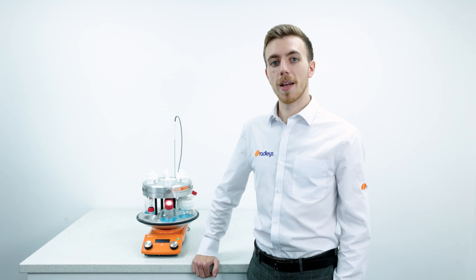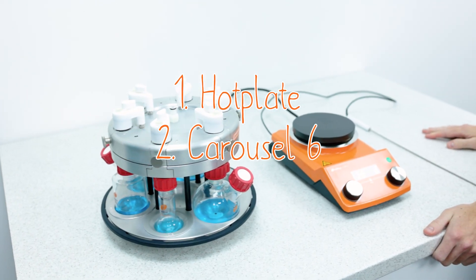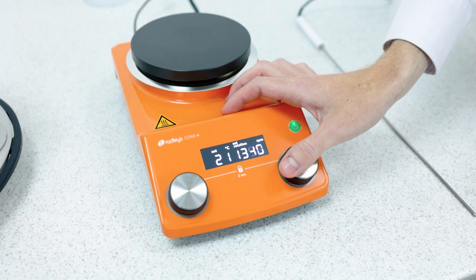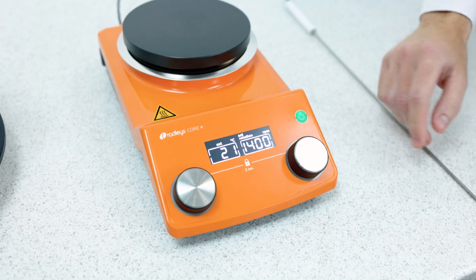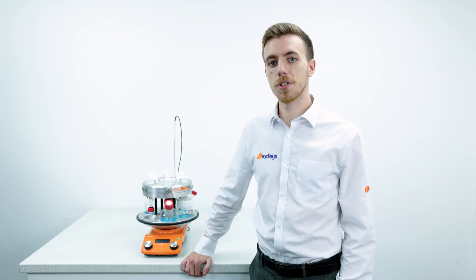The Carousel 6 Plus is made of three main components: the hotplate, the Carousel 6, and the glassware. The Carousel Core Plus hotplate has a digital interface with the ability to stir up to 1400 rpm, a locking feature which allows you to prevent accidental adjustment of values, as well as an external PT-1000 temperature probe for more precise temperature control.